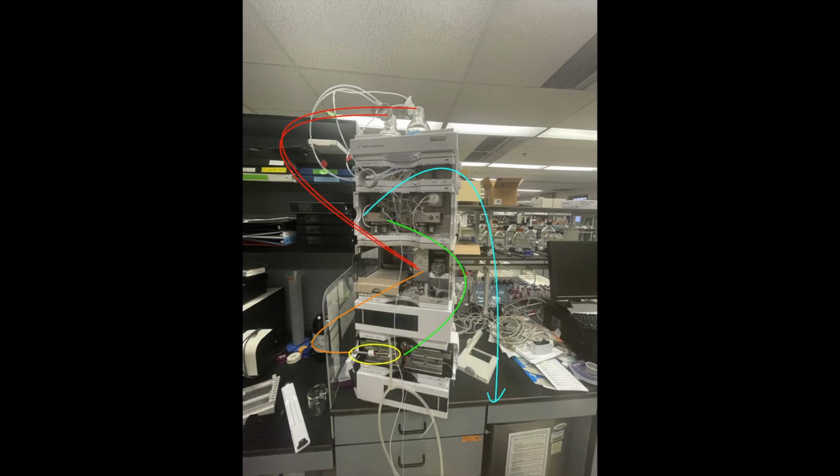And when we're looking at the HPLC itself, you can see there's 2 different bottles on top. One of them is mainly just water, and one is mainly just acetonitrile. So what first happens is you see towards the middle there, there's that tray where you can load a sample. And this sample is going to be loaded onto the column with basically just water. You're going to have water flow from the orange through the column.